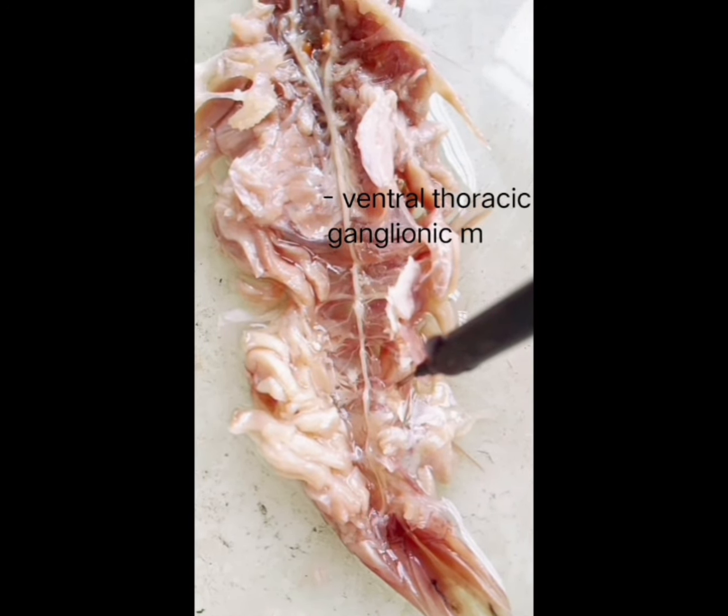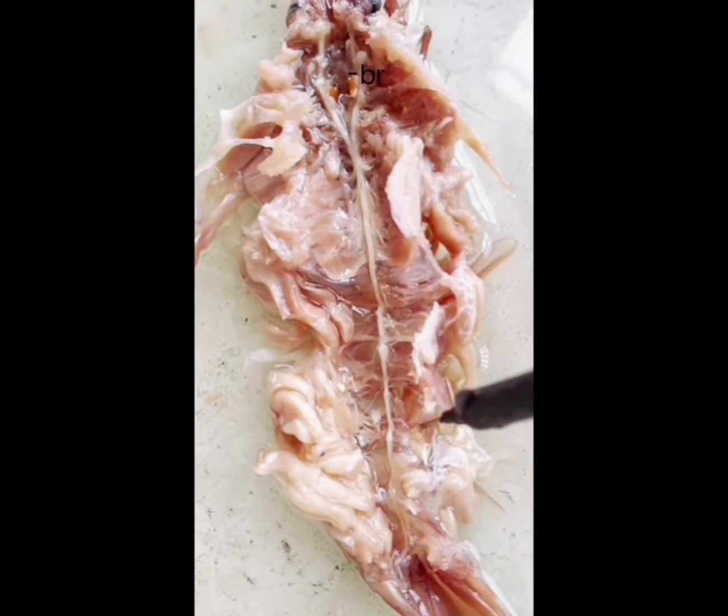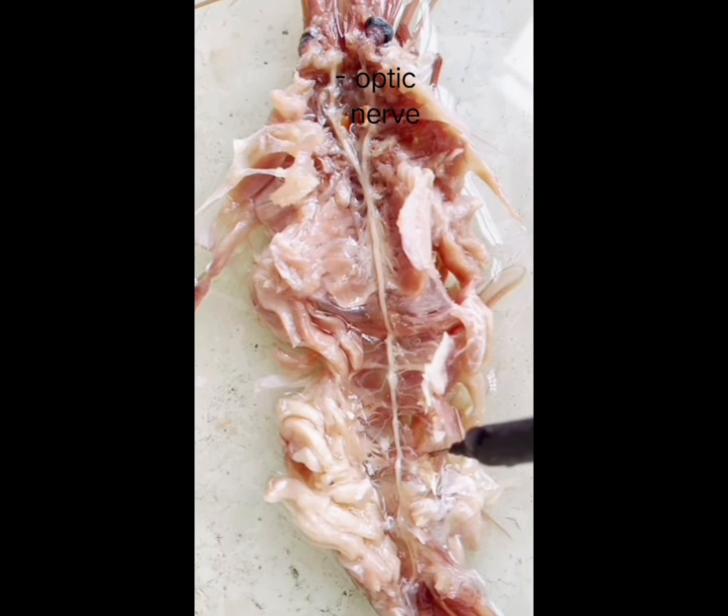We can clearly see the nerves going to the legs. We can see the sternal artery aperture, the circumoesophageal commissure, the brain, and the optic nerve.